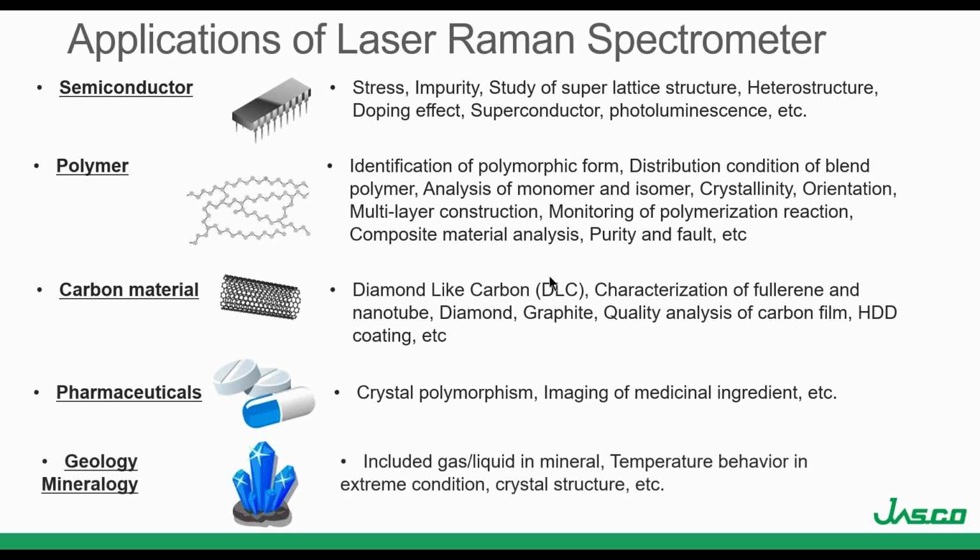And geology is a very common application, and this is one of the advantages of laser Raman spectroscopy. It is possible to measure the crystal structure and also look into any gas that is included in the mineral.